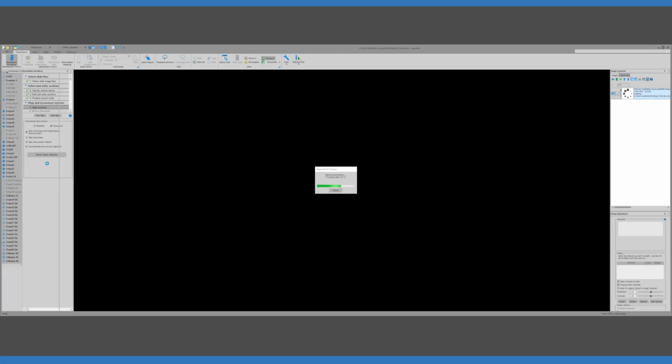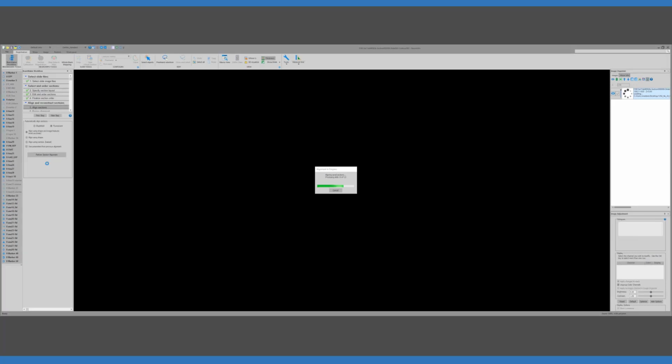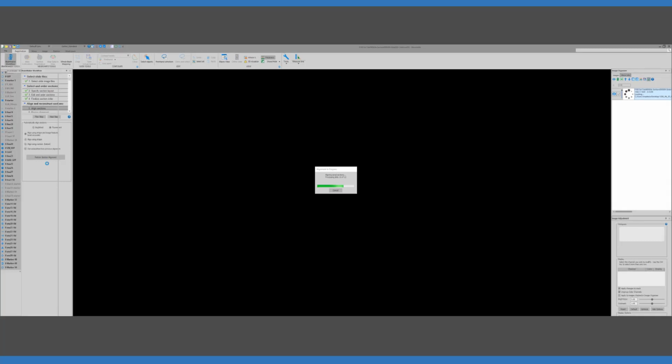The second option is to align using just the shape. What that does is it uses the outlines of the contours that we found during the segmentation step and just pays attention to that. It doesn't look at the internal content of the image. It's faster than using all of the image features. And again, it evaluates the rotation and translation to try to align those contours. It also evaluates flipping, which can work if there's a little asymmetry, or for example, as Chip mentioned, if a notch was cut in the brain or something like that. So even though there's not a ton of image information there, we can still evaluate the flipping and get it right most of the time.